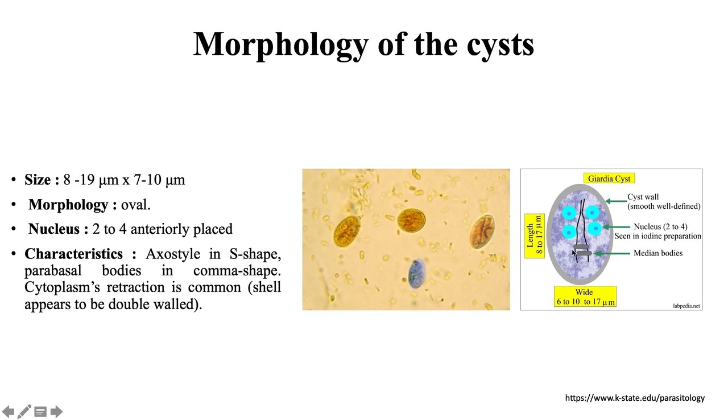Okay. Or sometimes comma shaped. Here, this is the median body, like a comma shape. Okay. يا طلاب, and this is under the microscope. This is the shape under the microscope.